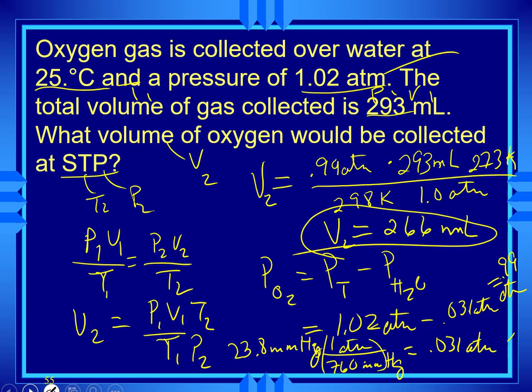And it should be pretty close to the same because the temperature went down, so you'd expect less volume, but the pressure went up, but we expect a little bit less for both of them, so, but not a huge difference. Now let's check and see how our graphs are looking.